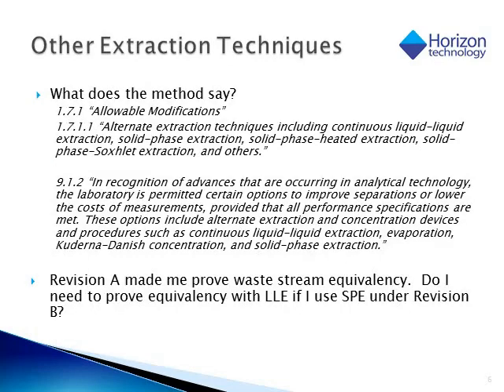This is a great place to start our audit topic discussion. While the US EPA Method 1664 Rev B specifically says that you can use SPE, we've gotten a lot of questions regarding demonstrating a proof of equivalency. In Rev A, most users were required to prove that the SPE procedure worked for their particular waste stream. So, do you also have to do this in Rev B?